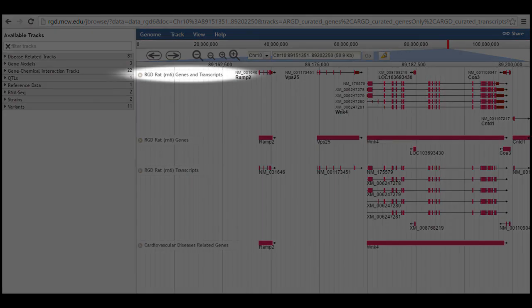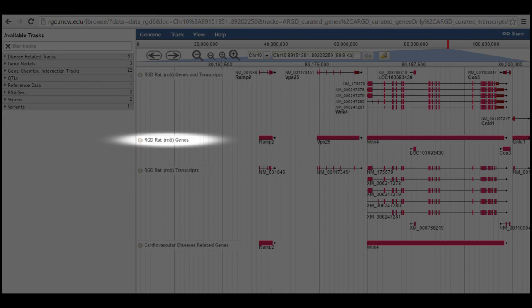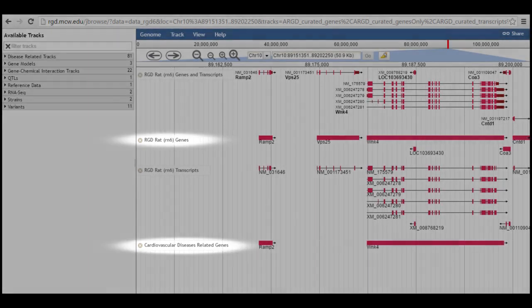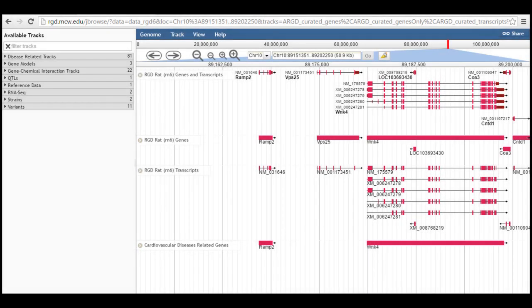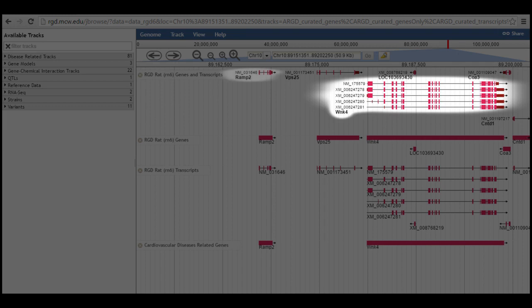Two, the RGD-RAT genes and transcripts track and the RGD-RAT transcripts tracks show transcripts or splice variants for each gene. The other two, the RGD-RAT genes track and the cardiovascular diseases-related genes show just the genes without giving details of the exon structure. As you can see here, WNK4 has multiple transcripts, whereas other genes in the display such as RAMP2 and VPS25 only have a single transcript each.